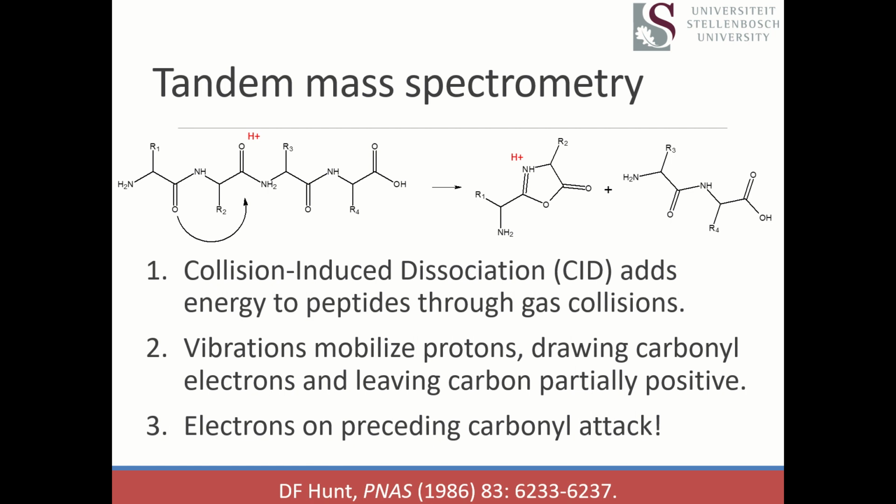Okay, so that proton usually sits in a nice, cozy, basic site. Normally that's a nice arginine side chain. I mean, that thing looks like a big catcher's mitt if you look at it from a chemical perspective. Or a nice lysine side chain, which is convenient given that we're cutting at arginines and lysines. But there's also the possibility that you may have a proton riding along on the N-terminus of the peptide, because the N-terminus of a peptide is a primary amine.